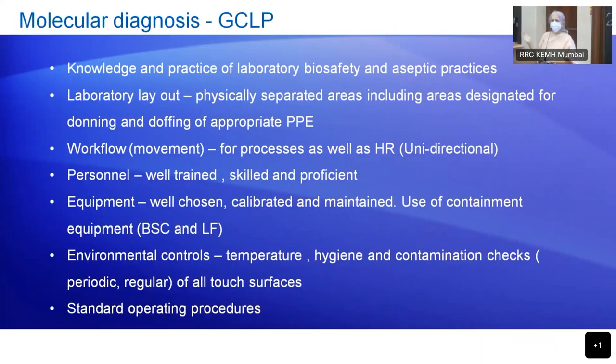So what are these? We should have good knowledge and practice of laboratory biosafety practice. You know how obsessed people were with personal protective equipment while circulating samples for COVID testing.